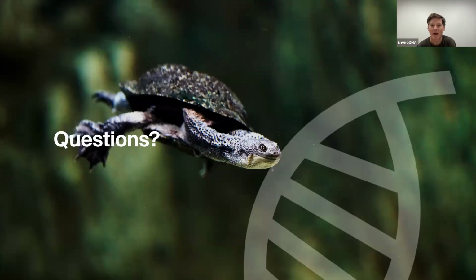I was seeing really encouraging data for monitoring in the holds of fisheries vessels, for instance. So in particular contexts, if you do the work and you show that it is possible for your problem, your sampling method, your analysis method, and your targets, I think it's possible to get that information. You would never attempt it on, say, a really, really broad metabarcoding assay, of course, where you're comparing taxa across the full tree of life.